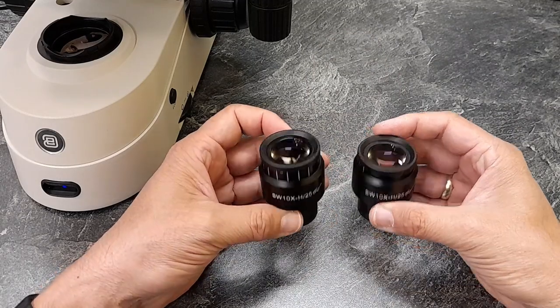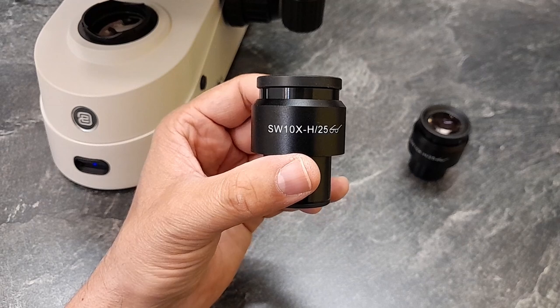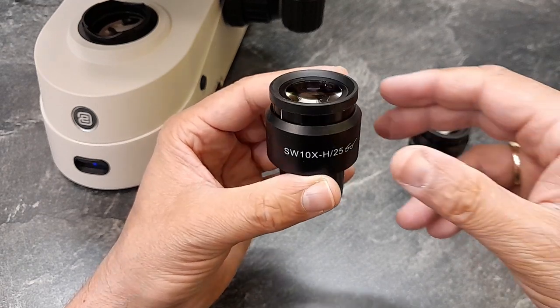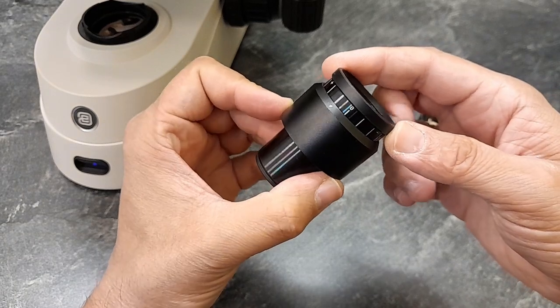The eyepieces are also quite large. They have a field number of 25. This is significantly larger than the standard eyepiece field number of 18. This means that you're able to see a much larger amount or area of the specimen when you look through the microscope. And this gives you a much more immersive impression. And this is also important for ergonomics again. Because when you are able to see more of the specimen, it's also much easier for you to find your way around as you explore the different parts of the specimen. I already mentioned that each eyepiece has a separate diopter adjustment. And this is of course important to even out any differences in eyesight that you might have.